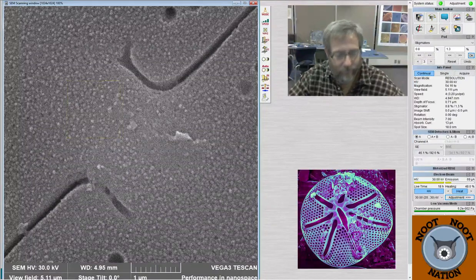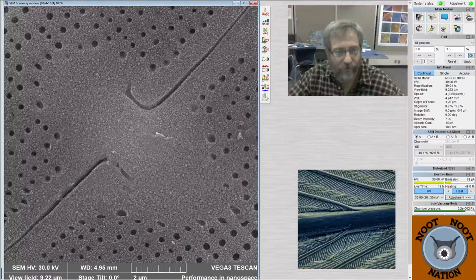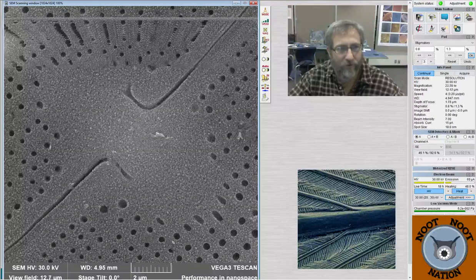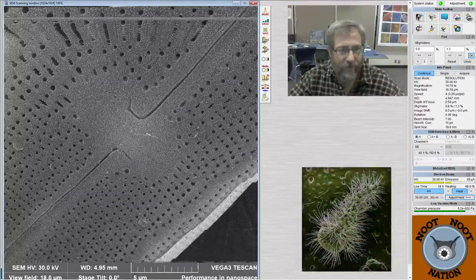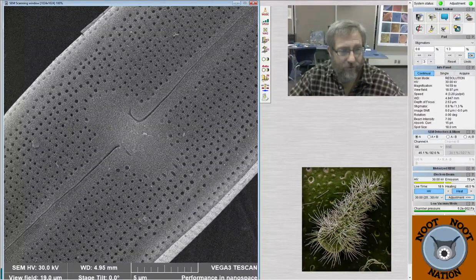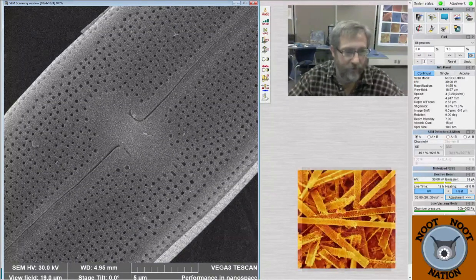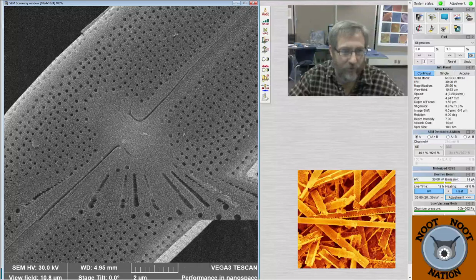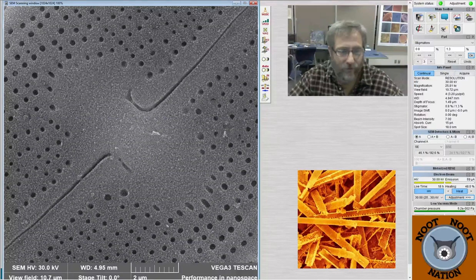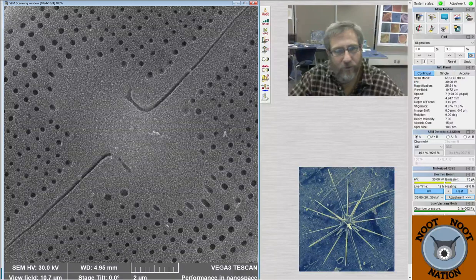Neidium have this characteristic where the proximal raphes deflect in opposite directions. And it's really obvious because they have a big wide open face. Most of the diatoms that are this sort of shape, that are naviculoid or boat-shaped, don't have raphes that go in opposite directions on the proximal ends. So we'll slow down and take a picture here.